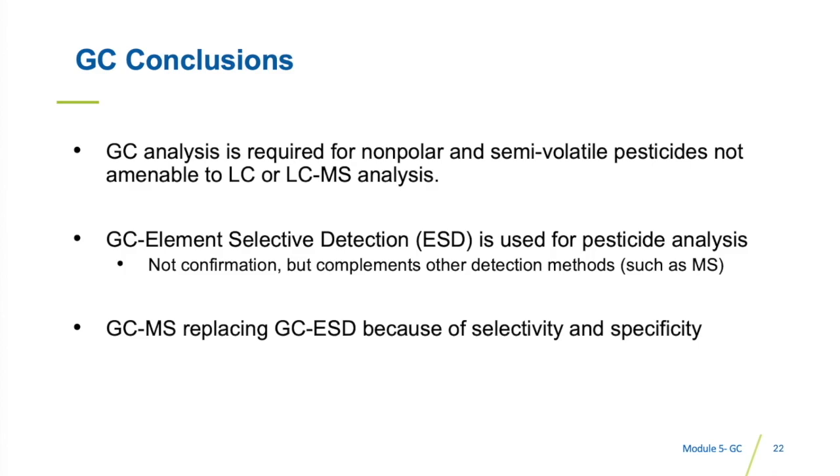However, mass spectrometry in the form of a single or tandem quadrupole is playing an increasingly important role for the identification and quantification of a wide variety of chemical contaminants. However, the high cost of this type of detector, the higher cost of maintenance, and most importantly, the specialized workforce that is hard to find, mean that there will still be a need for other detectors for many years to come.